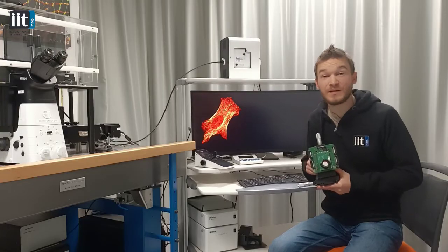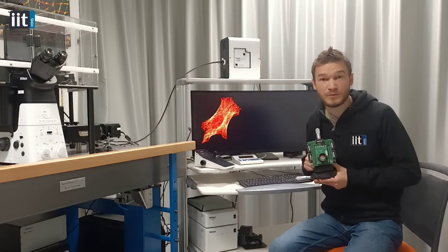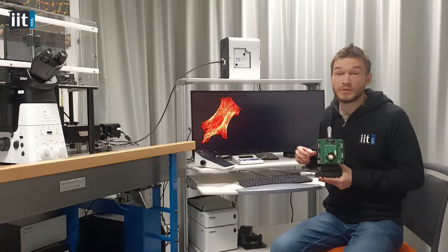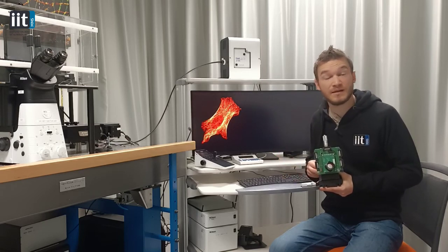Similar techniques have already been developed recently, but now, thanks to the SPAD camera, a lot of improvements can be expected, including the possibility to visualize cells with molecular resolution, which will allow us to understand with unprecedented detail how cells work.